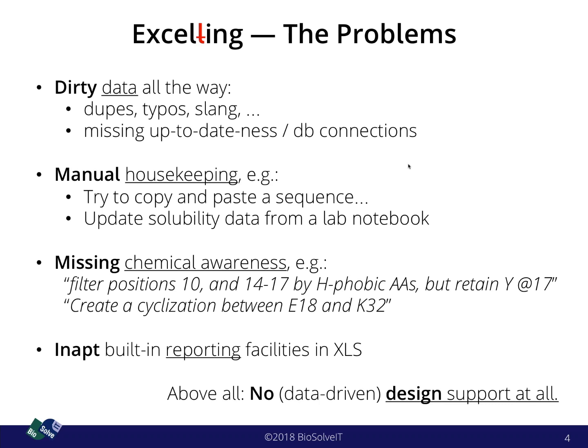Yeah, and then there is the other point, the second part of our PepSee product development here, namely the design support when it comes to aid or help when you actually design the next peptide that isn't even in your Excel sheet. It was then when we realized, in collaboration with Zealand Pharma, that we have to do something about it.